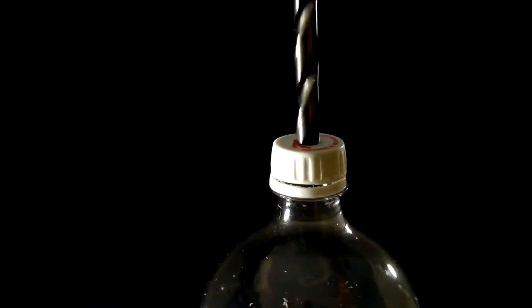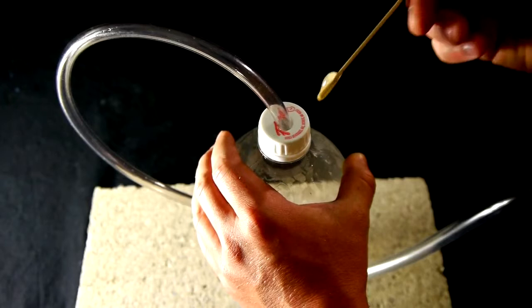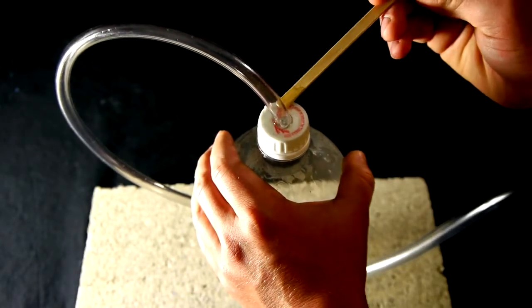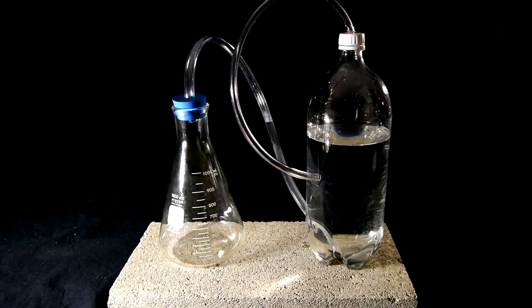A hole is now drilled through the bottle cap to fit the smaller quarter inch tubing. The end of this tubing is then inserted and likewise epoxied into place. With these steps complete, what we now have is a setup where hydrogen gas can be produced in the flask on the left. As the gas is produced it is directed through the 3 eighths inch vinyl tubing into the bottom of the 2 liter bottle which is filled with water.